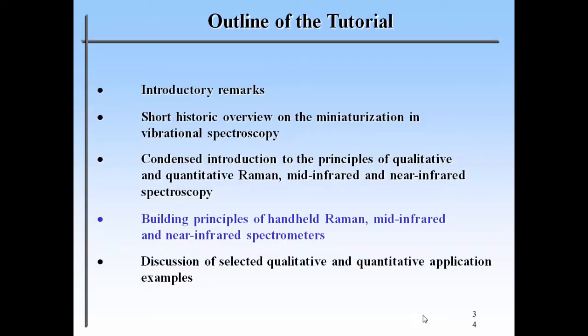Building principles of handheld Raman, mid-infrared and near-infrared spectrometers.